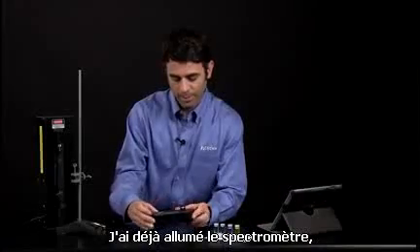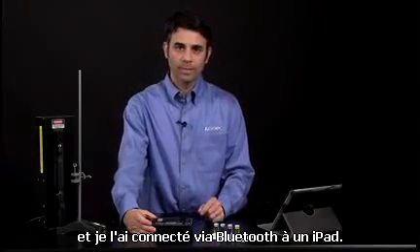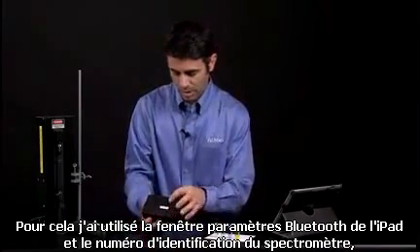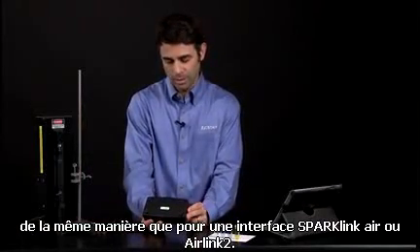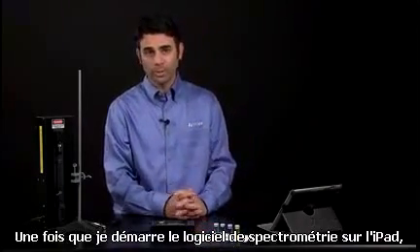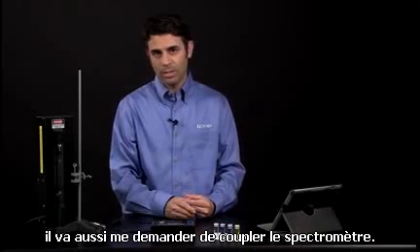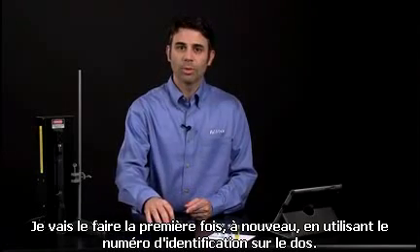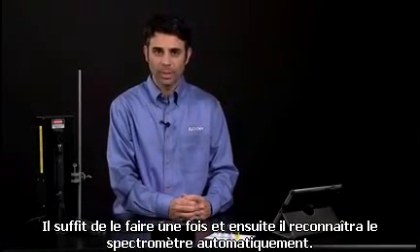I've already turned the spectrometer on and connected it via Bluetooth to an iPad. I did that through the Bluetooth settings using the spectrometer ID number, similar to the way we pair SparkLink Airs and AirLink 2s. Once I start the spectrometry software on the iPad, it'll ask me to pair the spectrometer. After doing that the first time using the ID number on the back, it'll recognize the spectrometer and pair by itself.